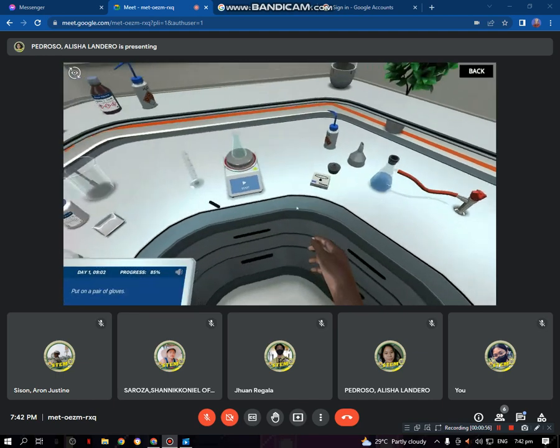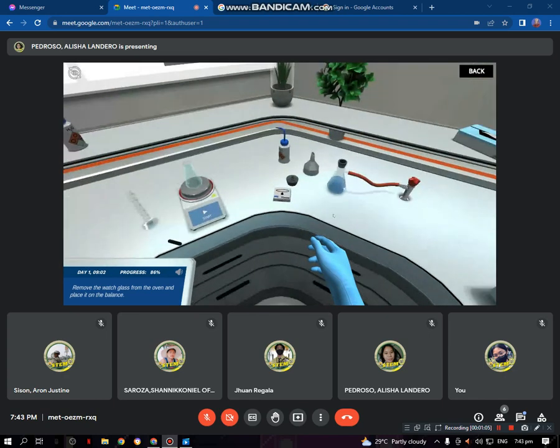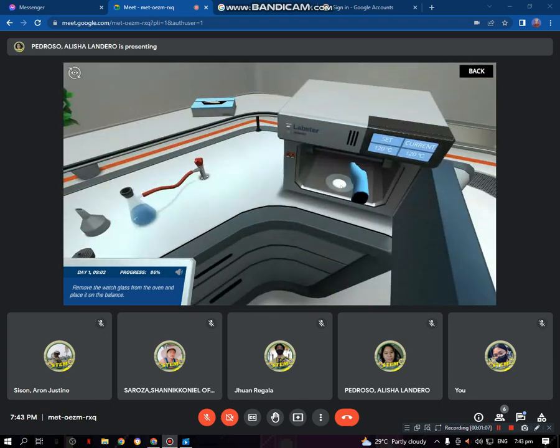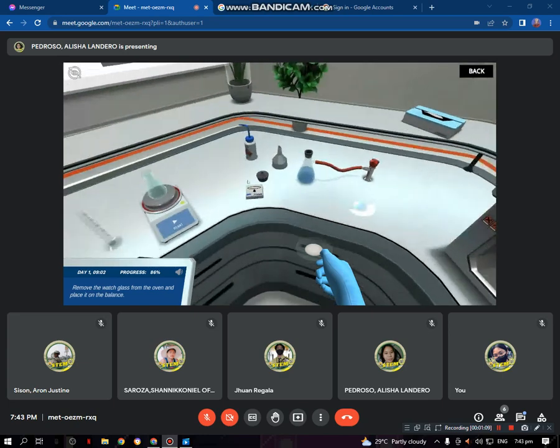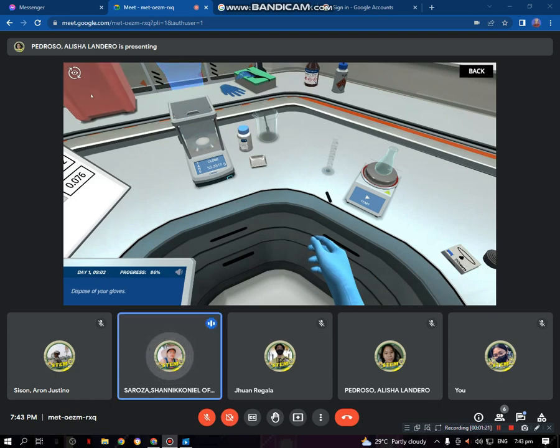Put on a pair of gloves. You have picked up the gloves. Remove the watch glass from the oven and place it on the balance. You have placed the watch glass. Dispose of your gloves. You have disposed your gloves.